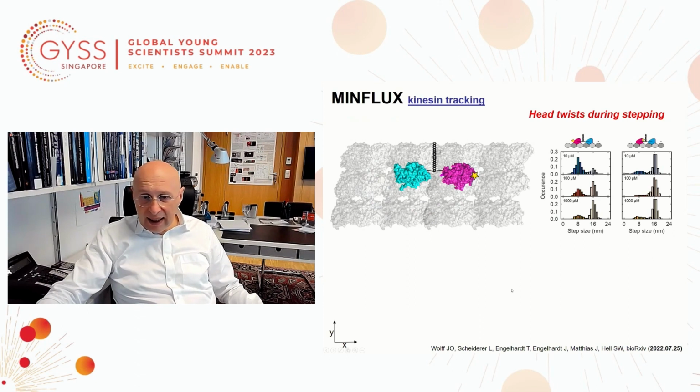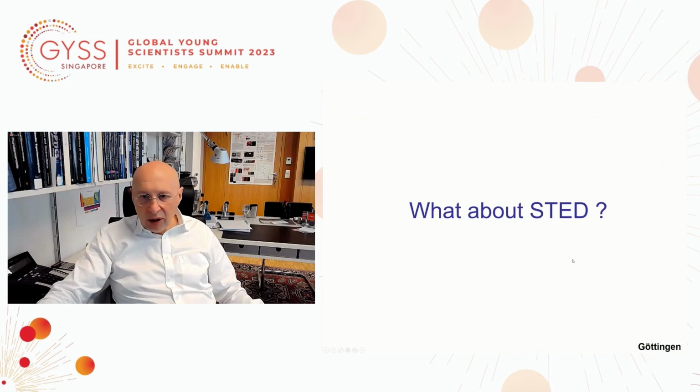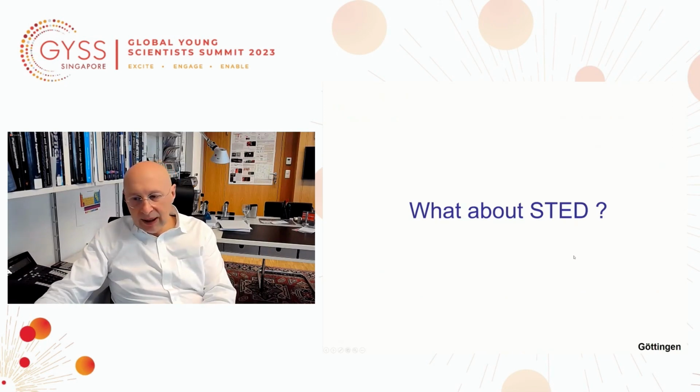These are the data. And so if we do that and measure the tracks, you find out mechanistic details that couldn't be seen before, and we could see that the steps have a bias to the right and so on, and we found out about the details. I'm not going to speak about that. It's published, and will actually come out very visibly soon.